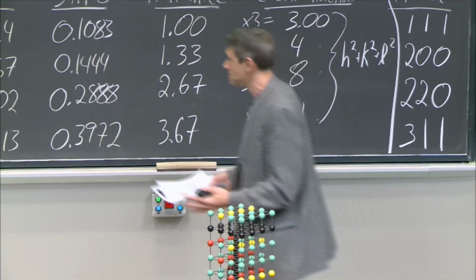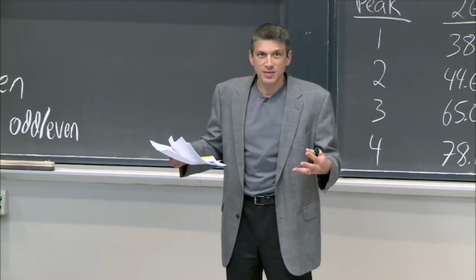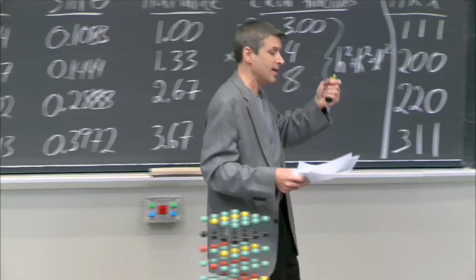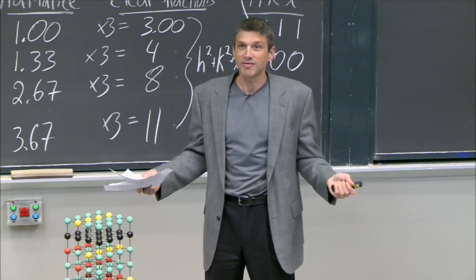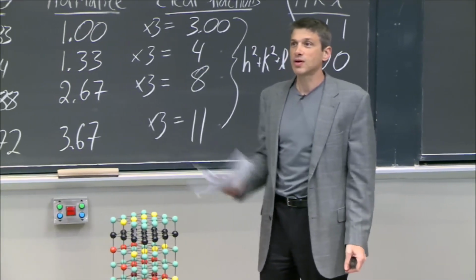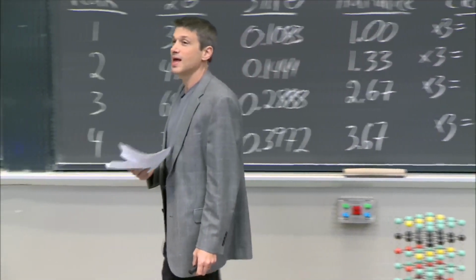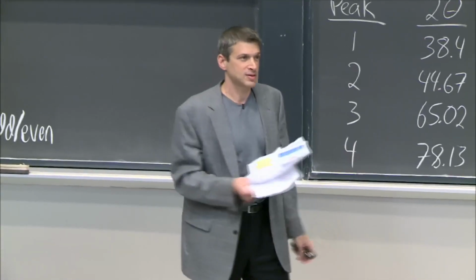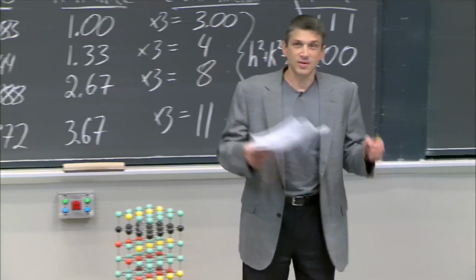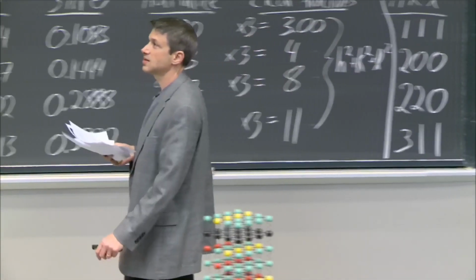How powerful this is. Because we've learned about perfect crystals, and now we've just gotten the single most important way to figure out which one we have. We shine X-rays on it, and we look for diffraction peaks. That's it. This is a very powerful tool, and it is used all over the place in materials chemistry, physics. You name the field, X-ray diffraction is a starting point for characterizing the crystal.